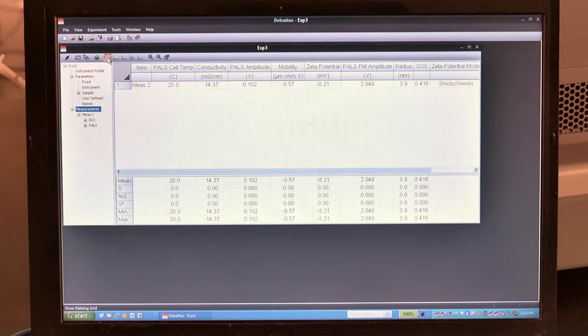The free surfactant is very small in size. It has a molecular weight of around 290 Dalton, which corresponds to 0.2 nanometers in radius. The micelles are larger in size. They have a radius of around 1.9 nanometers. Still very difficult to size by dynamic light scattering, right near the limit, but still detectable in our instrument. And they're highly negatively charged particles, so they have a very negative mobility and a very negative zeta potential. They're very stable. So we're going to see if we can size these with the DelsaMax Pro.